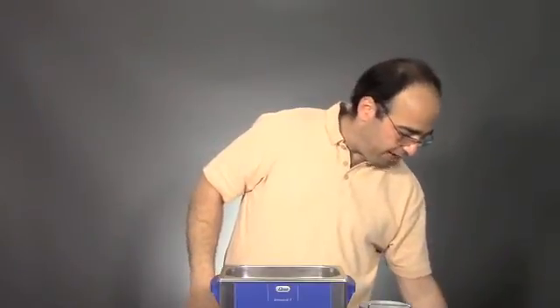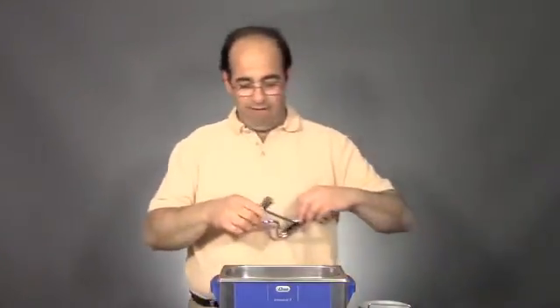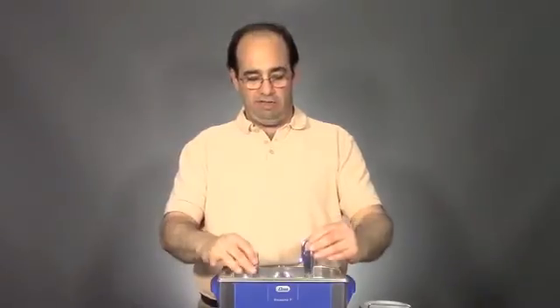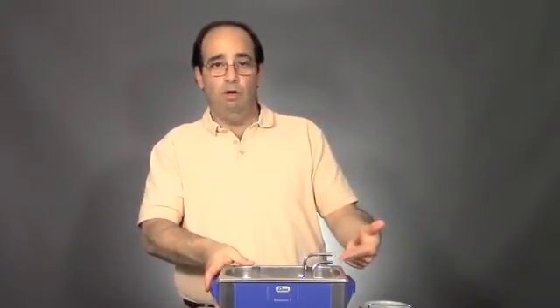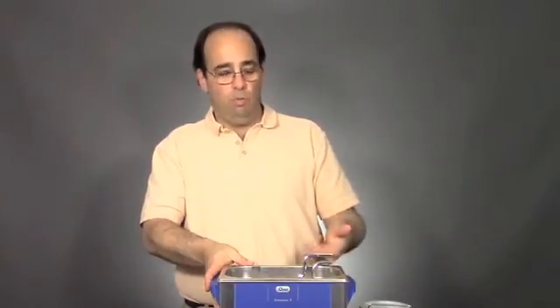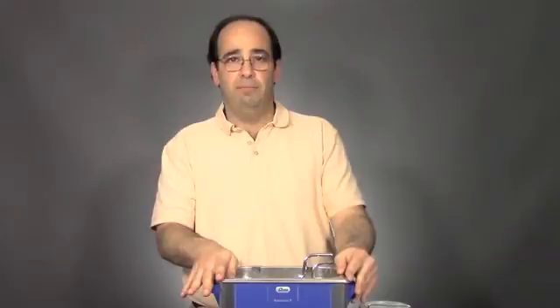And if you're doing samples that are heat sensitive, we have this cooling coil that just snaps right into place. You attach an inlet water and an outlet water on the side here. Run your cool water through and it keeps the liquid cool and your samples safe.